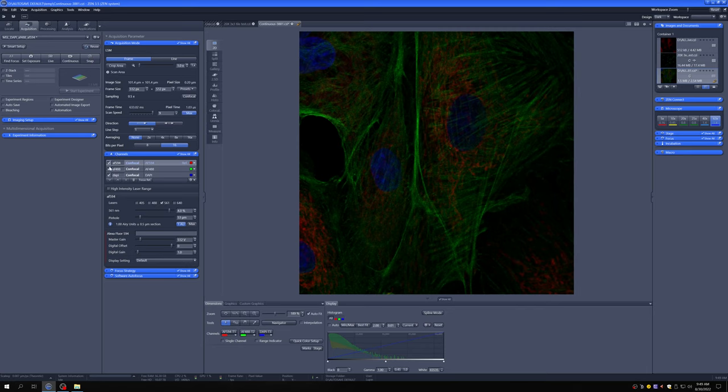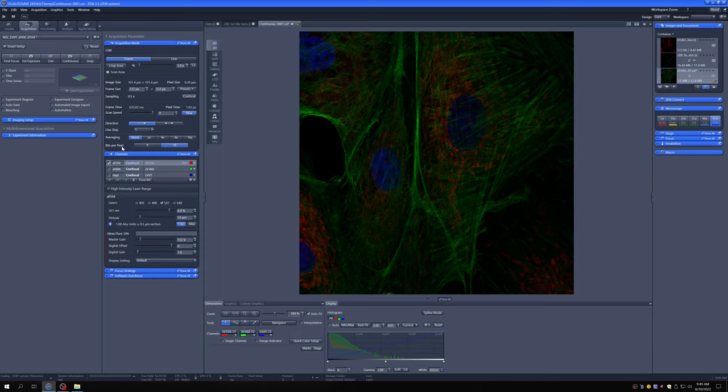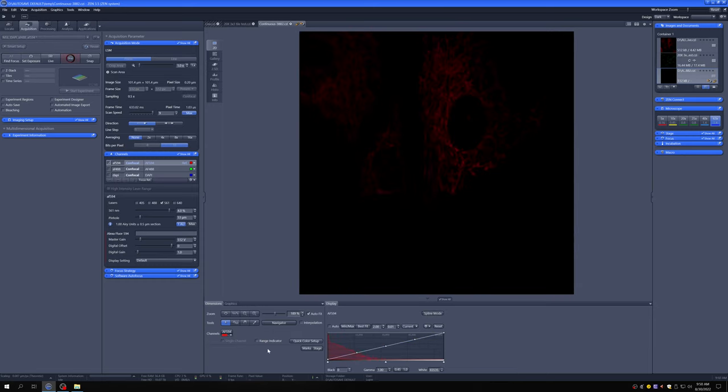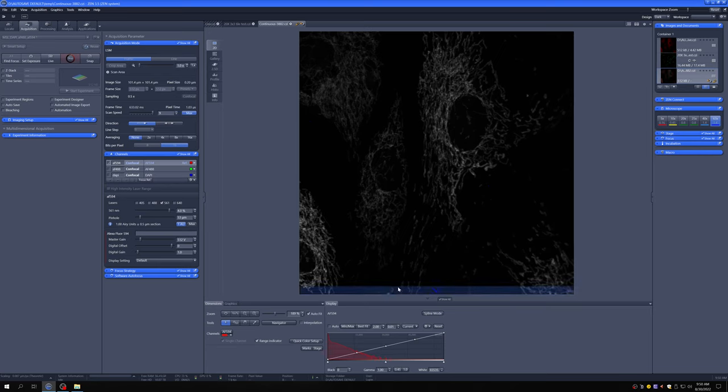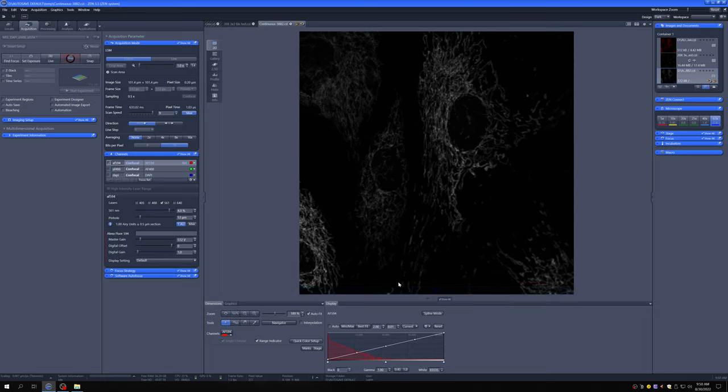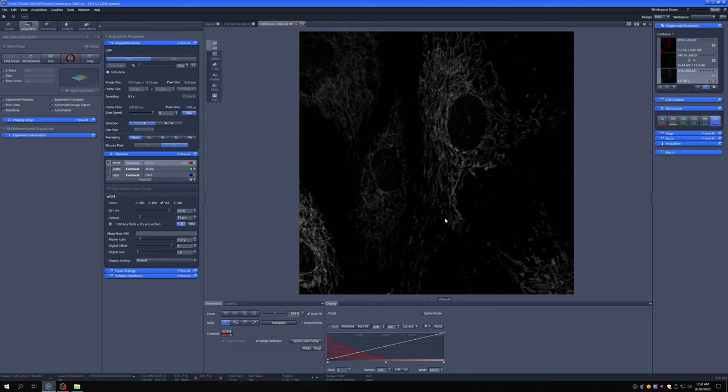When you're using continuous mode, you want to uncheck the things that you're not working on, both for speed and to avoid bleaching of things that we're not focused on at the moment. If I go to continuous and click on range indicator, you can see that it looks pretty good, but what other things can we do to improve quality?